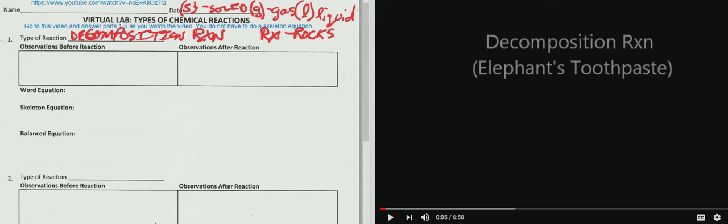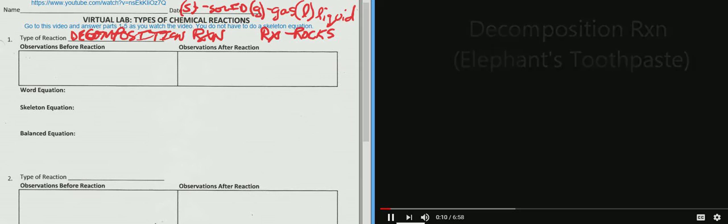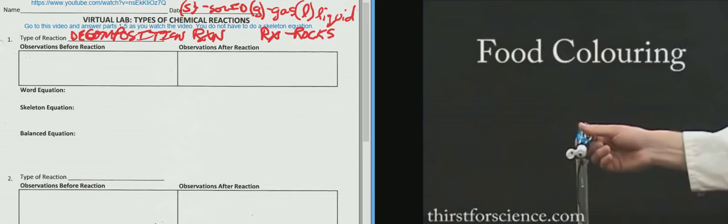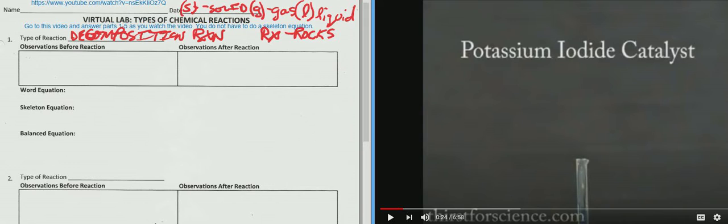So, observations before reaction. You click play again. Okay, so you have a liquid with soap, coloring, and potassium iodide. So you have a liquid, so you have H2O2. You're just writing what you see. Food coloring and soap.